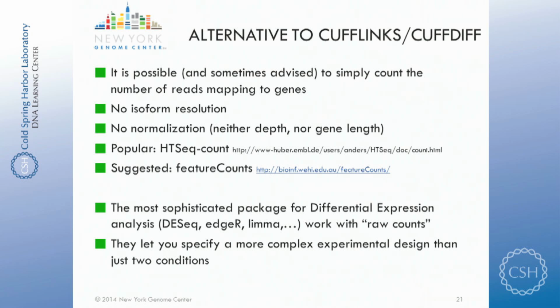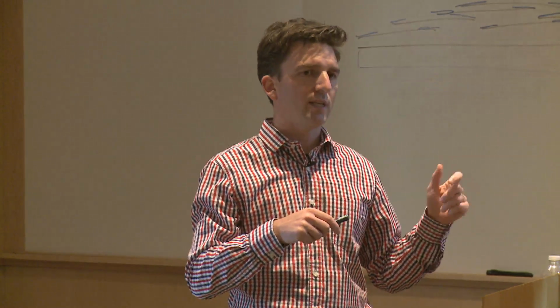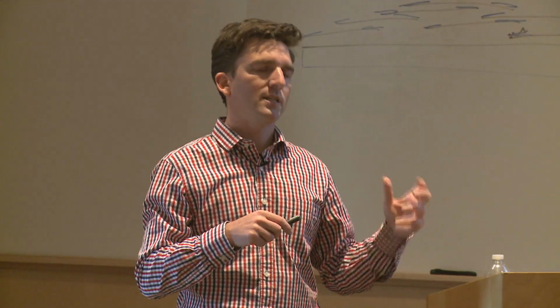The advantage of working with raw reads is that you can input them into those packages for differential expression analysis. Those are R packages in this library called Bioconductor. I don't know how familiar you are with R, but they're really developed by statisticians, and it's much more elaborate than CUFFDIFF, and it gives you access to much more sophisticated statistical modeling.